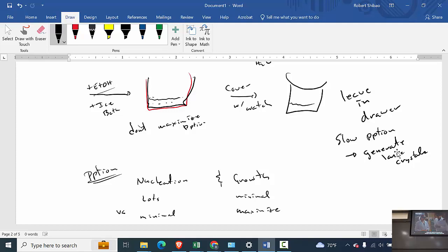Okay. Before we get started, I'll just point out the location of the safety equipment in the lab. Because you'll all be wearing your protective gear, you most likely won't need to use it, but it's important to know where everything is located. The eye wash is over there. Just pull the lever, and water will automatically turn on. To turn it off, just pull the lever back to its original position, and the water will stop flowing. The emergency shower is over there as well.